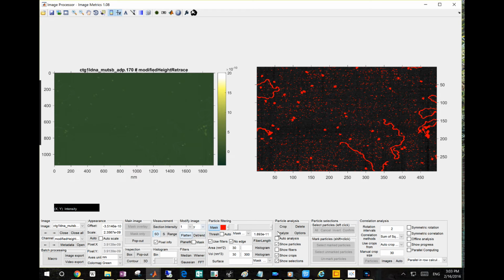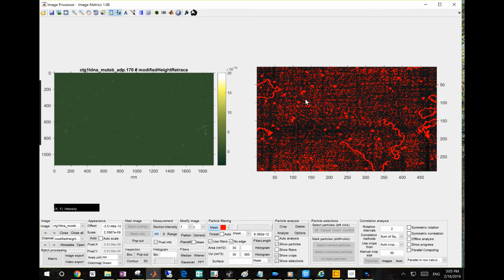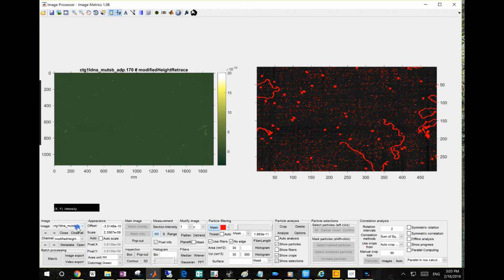So you see it's mostly flattened. How I say that is because the surface is almost randomly masked, which means they're almost flattened. If they're not randomly masked, you will see the mask area centered at some specific region in the spot, but it's not the case. So the y flattening looks well, and let's try the x flattening with second order.